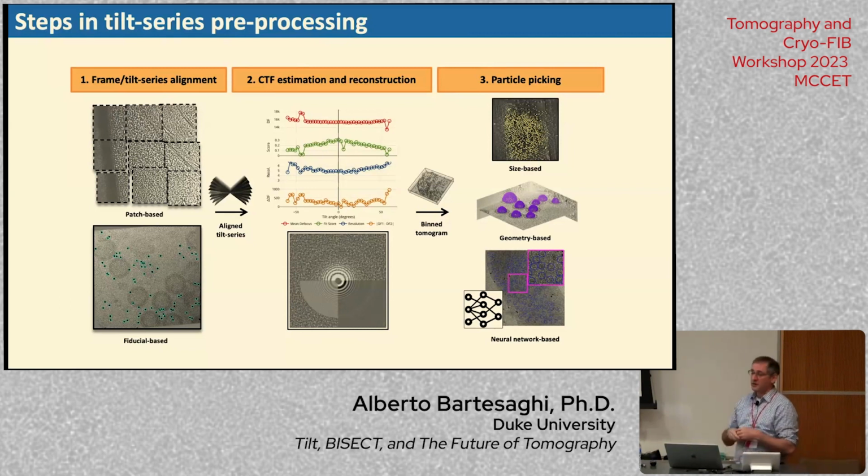For example, if you cannot align your tilt series, then your data is not going to be useful. So you better change your strategy or do something to change that. Because if you're not able to align your tilt series, everything else downstream is not going to happen. So this just tells you what you're collecting. Okay, so I can build tomograms, all of my parameters are good, my signal goes to high resolution, I can see the particles, and so forth.